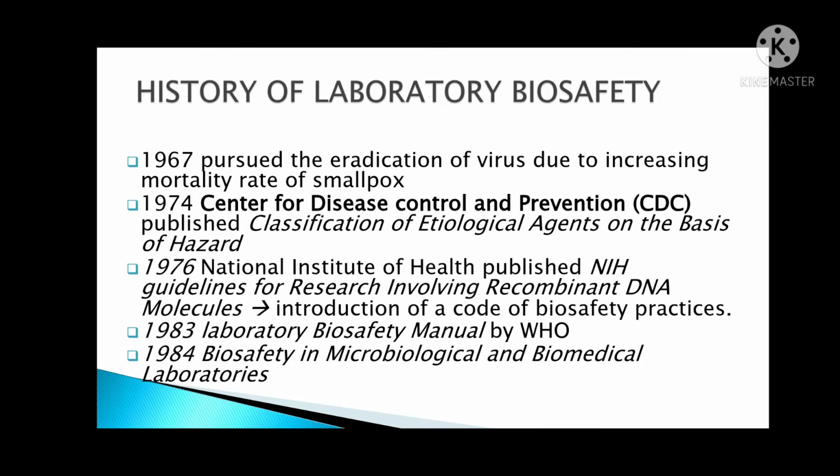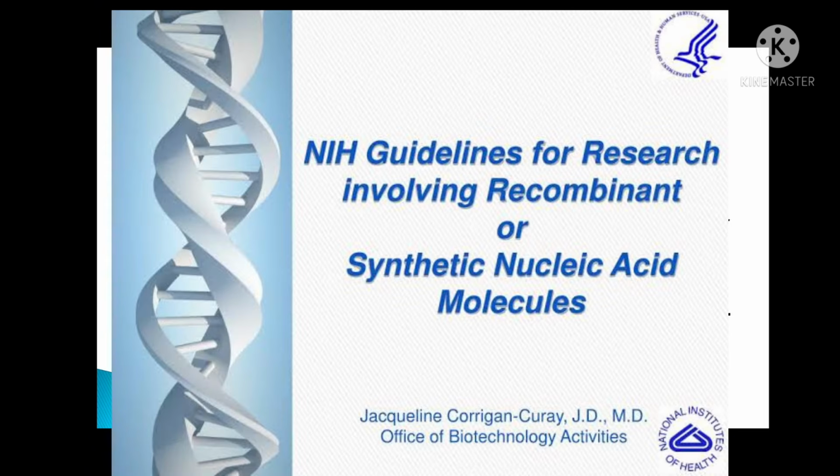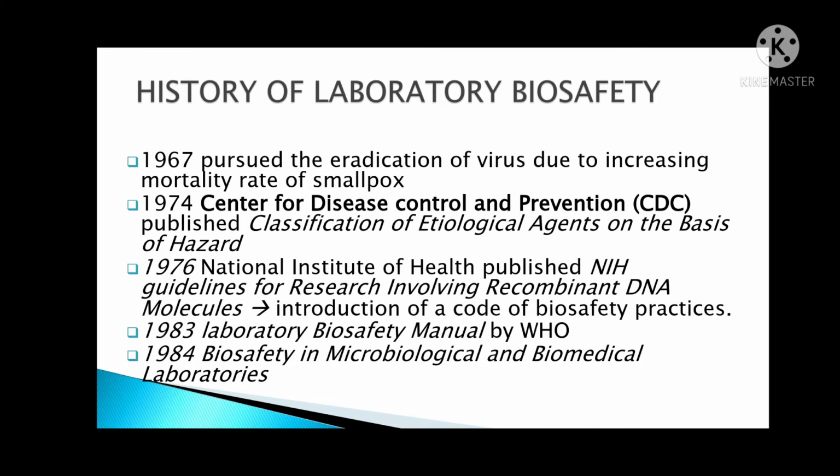Two years later, that means 1976, the National Institutes of Health of the United States published the NIH guidelines for research involving recombinant DNA molecules. It explained in great detail the microbiological practice, equipment, and facility necessarily corresponding to the four ascending levels of physical containment. The guidelines that were published laid the very foundation for the introduction of a code of biosafety practice.